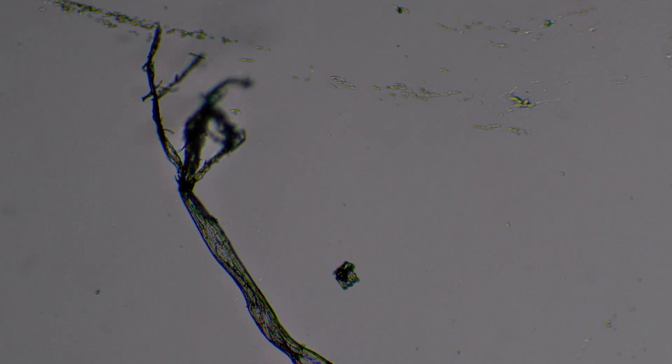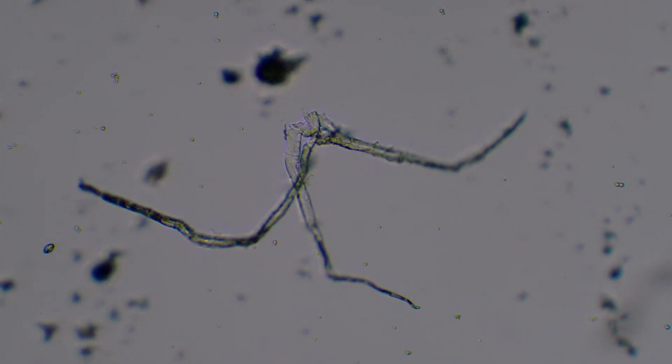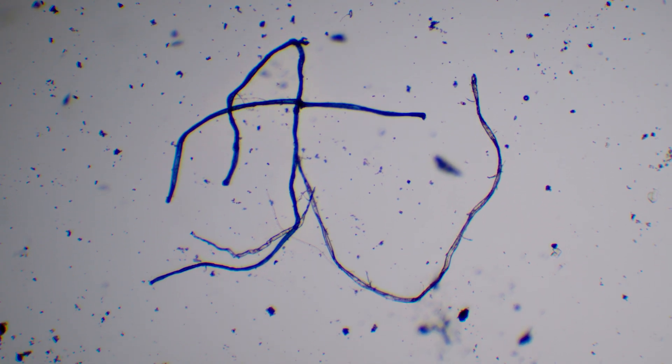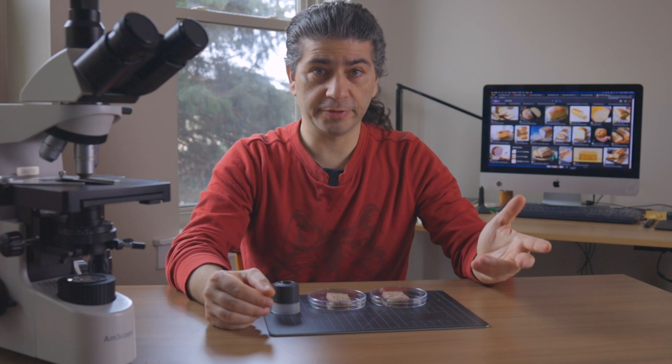Hyphae are the continuously growing network of filaments that digest, reproduce, and decide where to invade next. Some hyphae can produce neurotoxins as a by-product while executing these tasks.